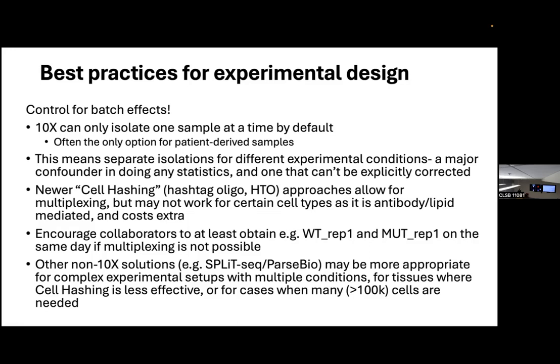So when you refer to replicates, do you mean rerunning the experiment on the exact same sample multiple times or having multiple samples? For example, if you're using human tissue, do you mean running the experiment on the same slide multiple times or having multiple slides from the same patient and running each once?